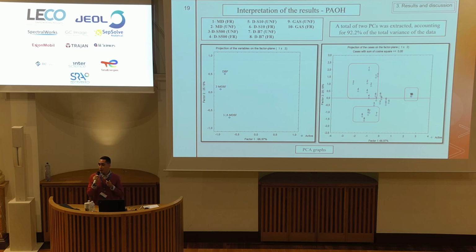And finally, for the oxygen compounds, we were not able to take any significant interpretation from it, probably because of the lack of compounds that we find. So the variability obtained from this data did not allow us to take any conclusion about it.